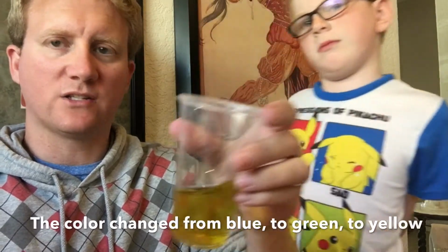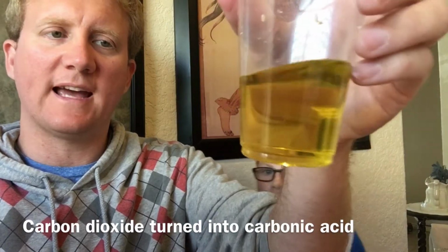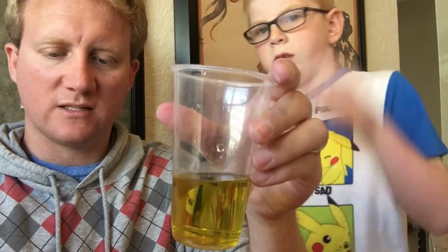Okay, so remember what we had said. It went from blue to green to yellow. And what happens is, at the beginning I talked about how the carbon dioxide dissolves into the water, turning into carbonic acid. And so the more acid you put into your liquid, the more it changes colors. We have a lot of acid in here. When it was green, we had a little bit of acid, and when it was blue, we had no acid. So this is more acidic. Green is less acidic, and blue is neutral, like water should be.